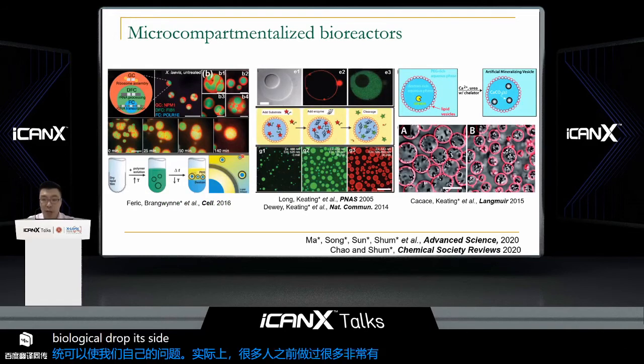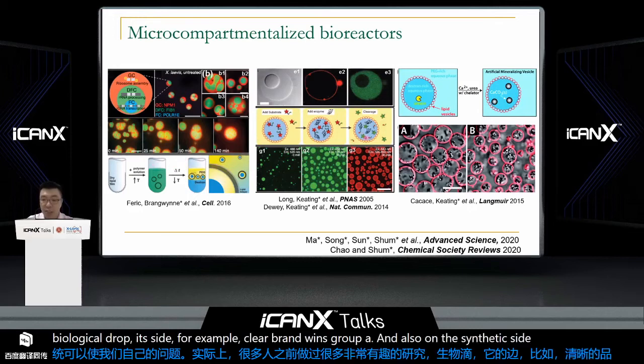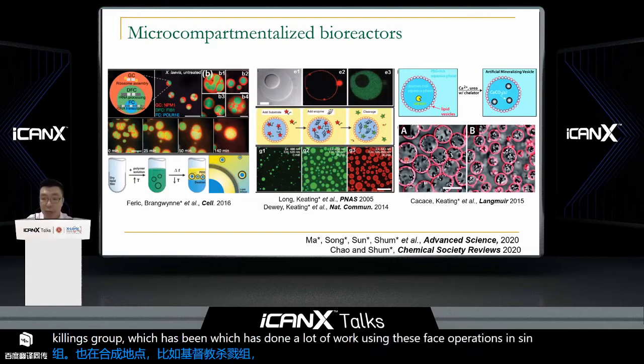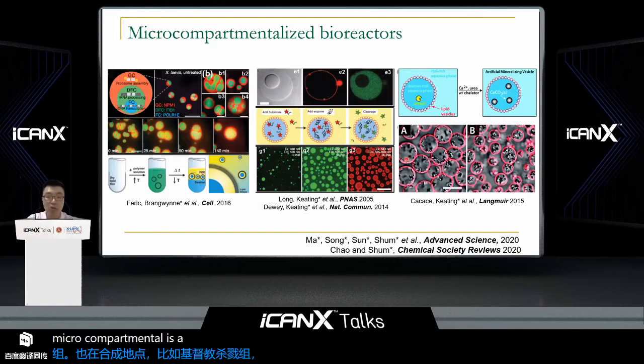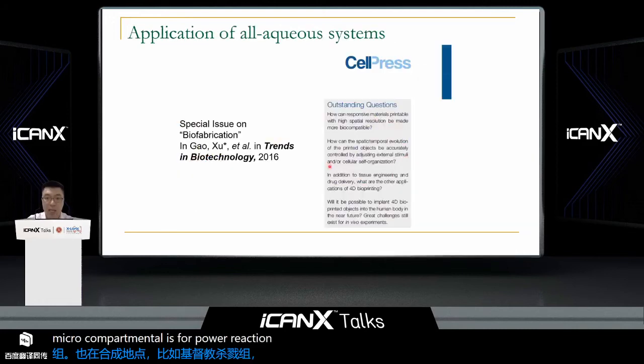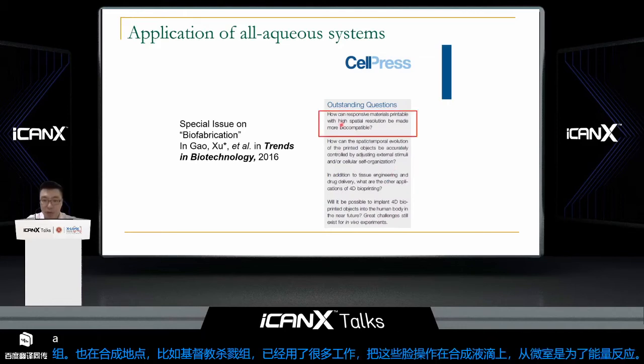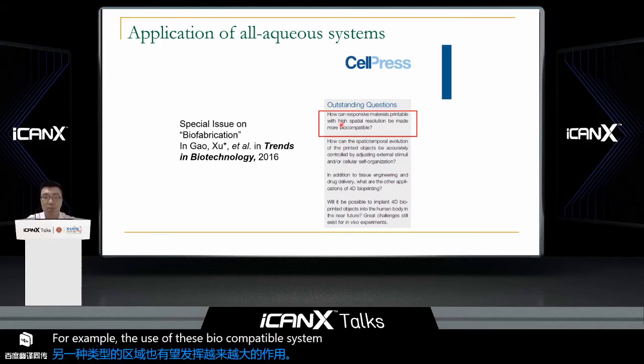For example, Cliff Brangwynne's group, and also on the synthetic side, such as Christine Keating's group, which has done a lot of work using these phase separations in synthetic droplets for microcompartmentalization for bioreactions. Another area that is also expected to play an increasing role is, for example, the use of these bio and cytocompatible systems to achieve responsive materials, patterns, and structures by printing.